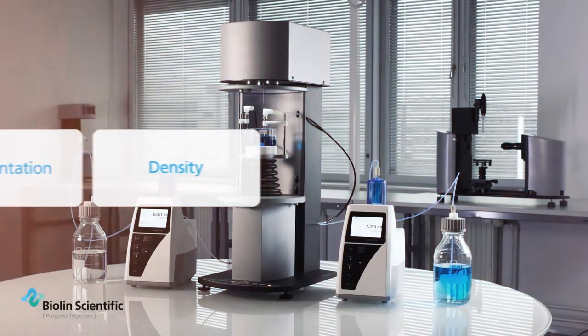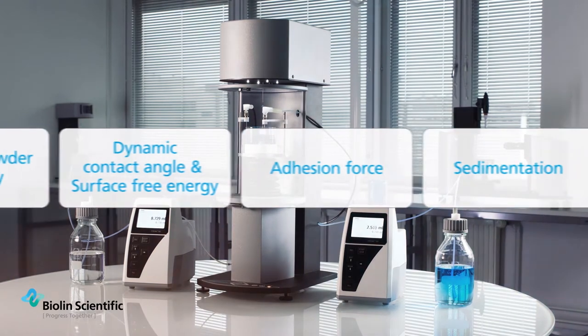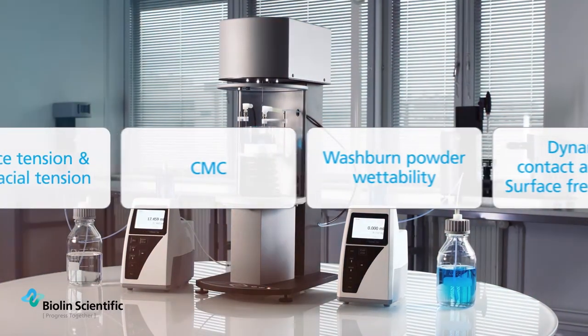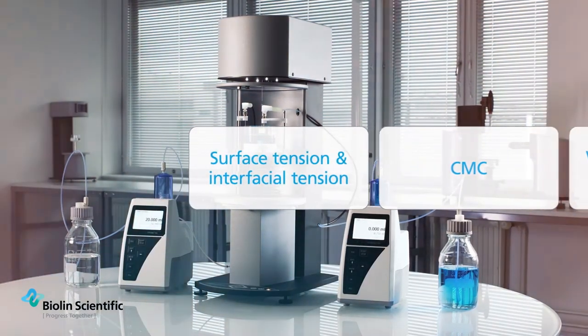Attention Sigma 700 and 701 are force tensiometers designed for optimal ease of use. They measure interfacial properties such as surface tension and contact angle.